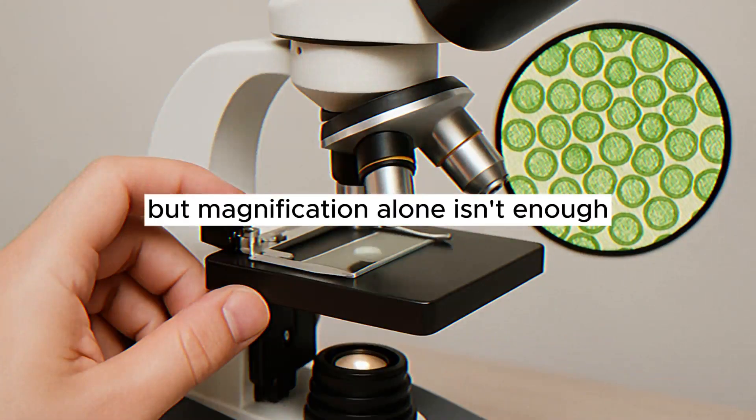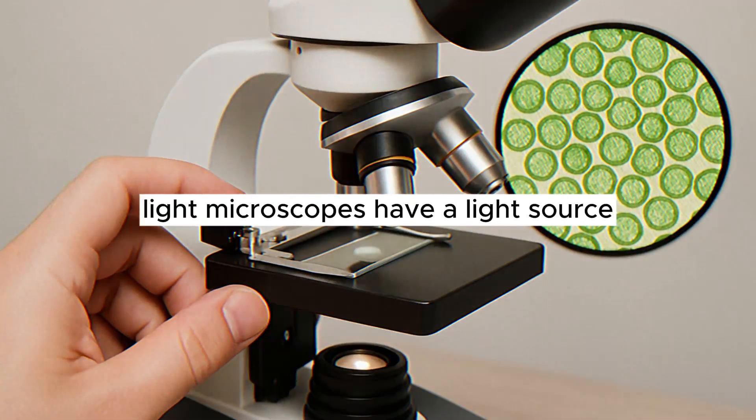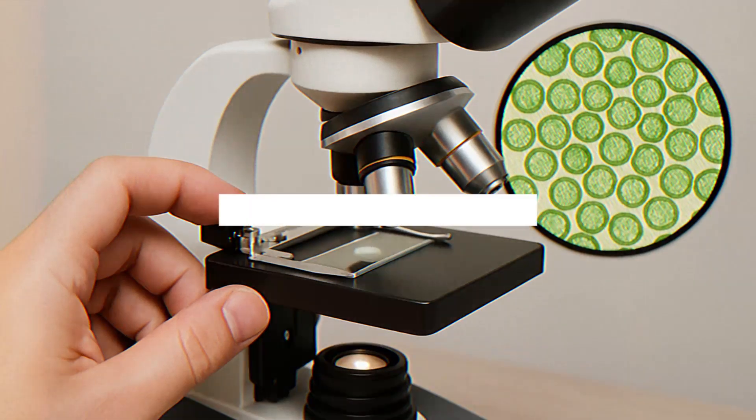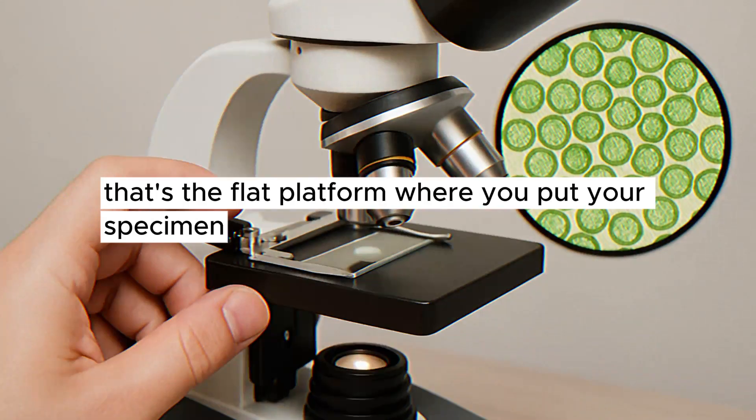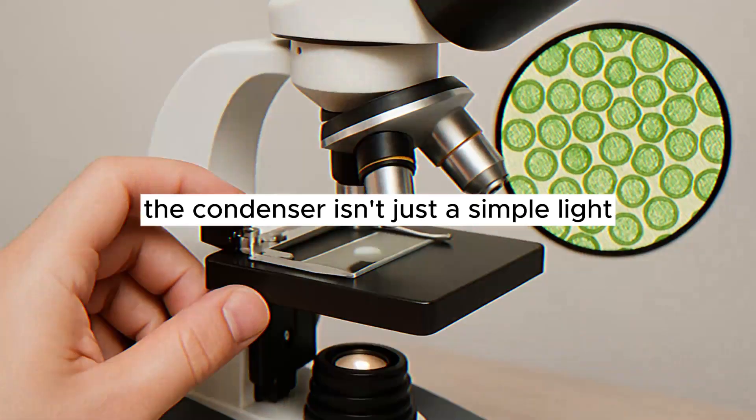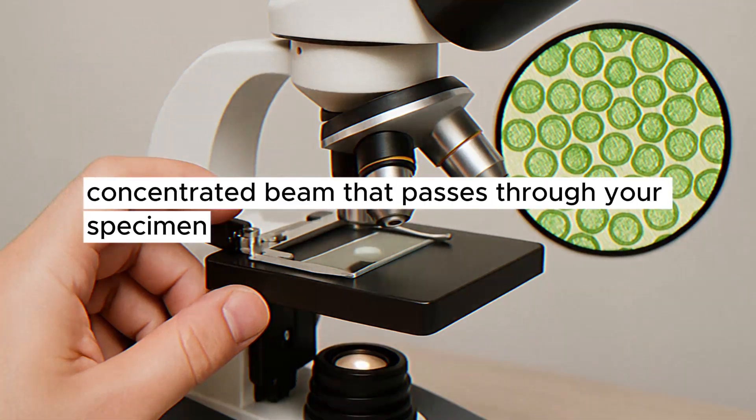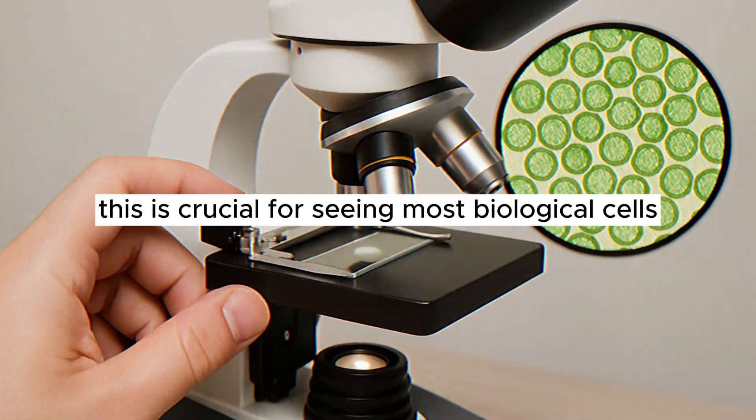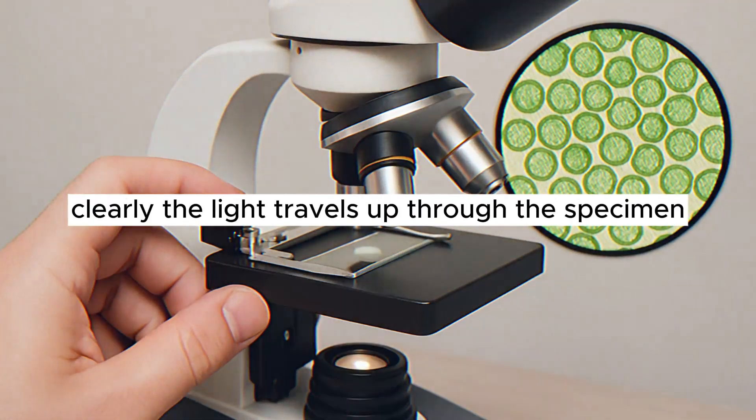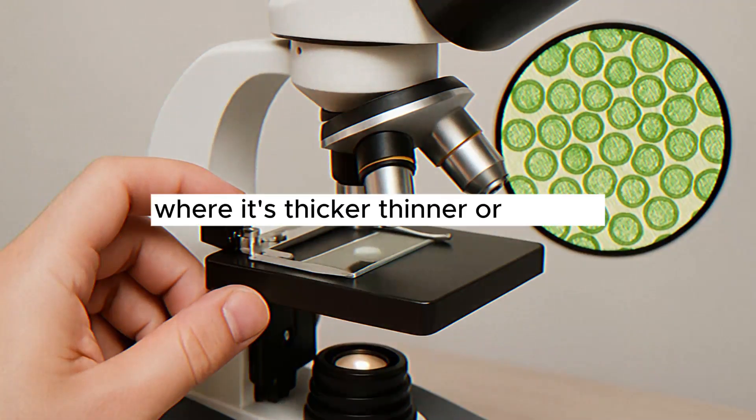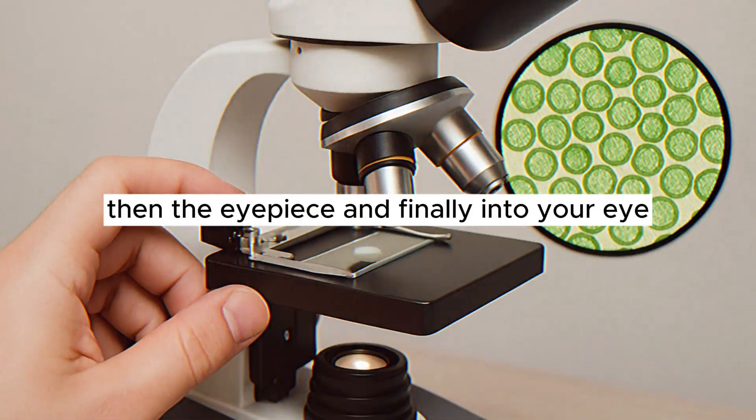But magnification alone isn't enough. You also need light. That's why compound light microscopes have a light source, usually a small lamp built into the base. This light shines upwards. Below the stage, that's the flat platform where you put your specimen, there's a condenser. The condenser isn't just a simple light. It's a special lens system that focuses the light into a bright, concentrated beam that passes through your specimen. This is crucial for seeing most biological cells clearly. The light travels up through the specimen, carrying information about its structure, where it's thicker, thinner, or stained, then through the objective lens, then the eyepiece, and finally into your eye.